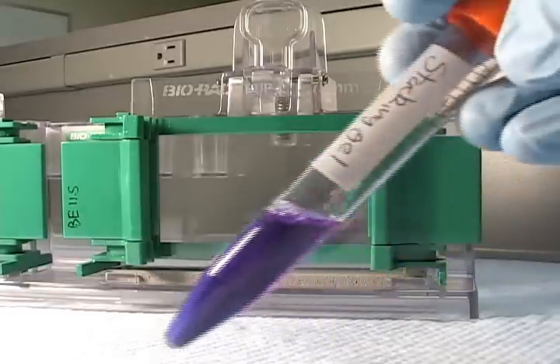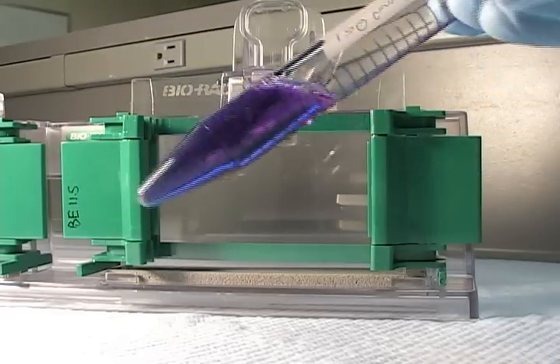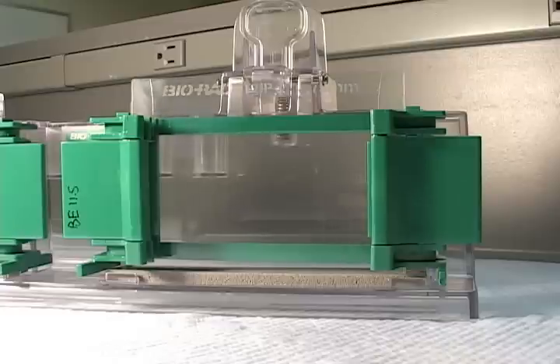Here's the stacking gel. I've just added the Temed and the APS, and to this I've added some bromophenol blue so you can tell the difference between the stacking gel and resolving gel. I'm going to do the same thing I did before — load the gel via pipette, almost filling it the rest of the way.